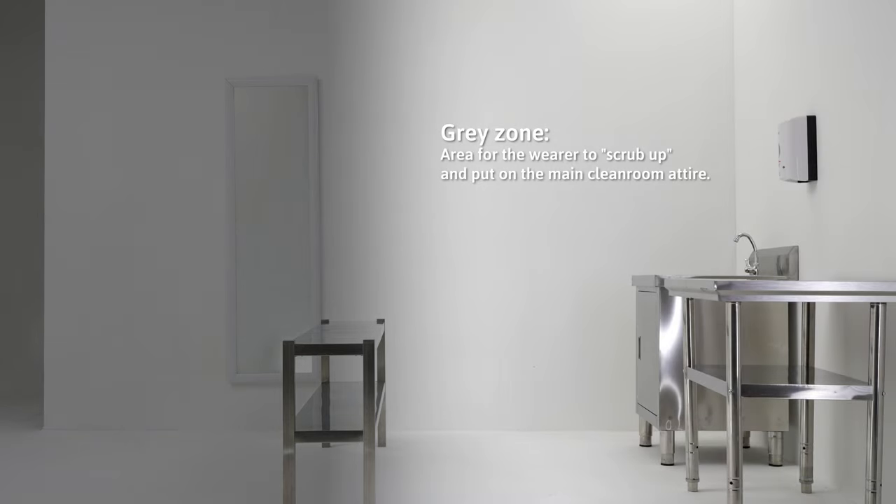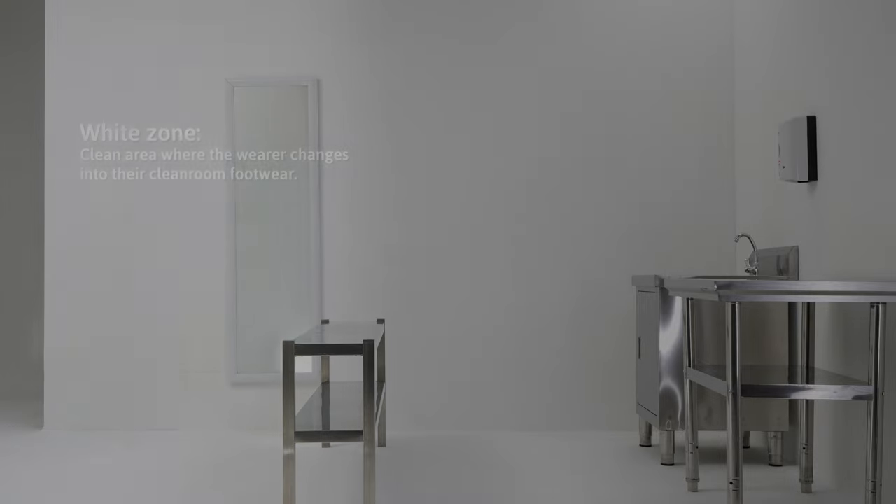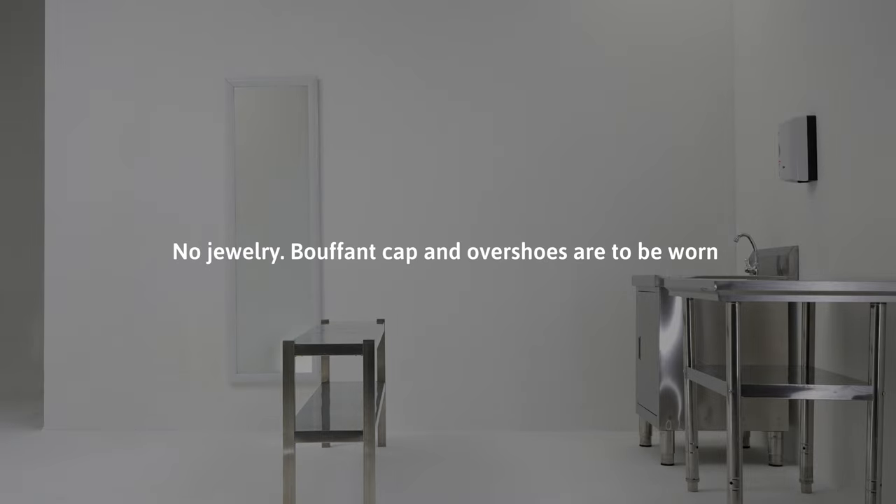Gray zone: this is an area for the wearer to scrub up and put on the main clean room attire. White zone: this is a clean area where the wearer changes into their clean room footwear. The wearer is required to remove facial cosmetics and jewelry. Bouffant cap and overshoes are to be worn prior to entering the gray zone.